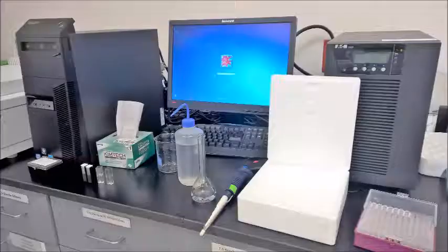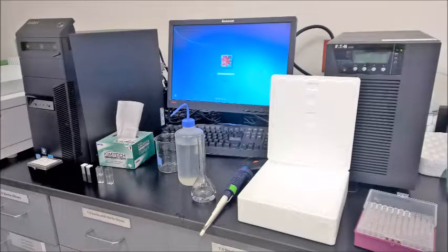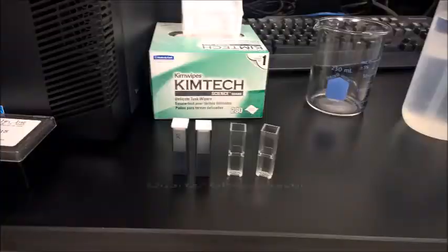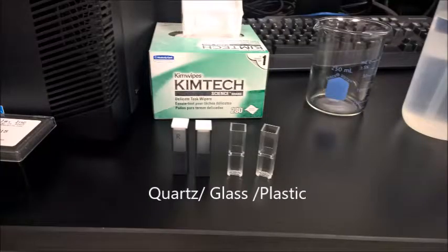The sample will be placed in a cuvette for measurements. There are three types of cuvettes: plastic, glass, and quartz.